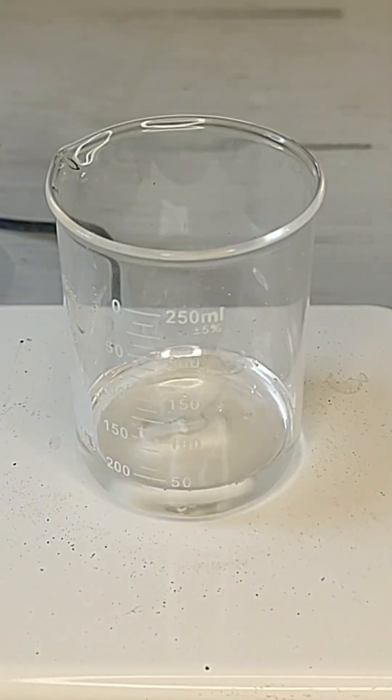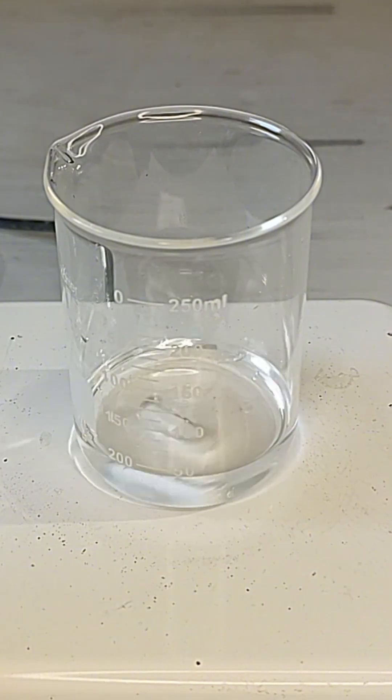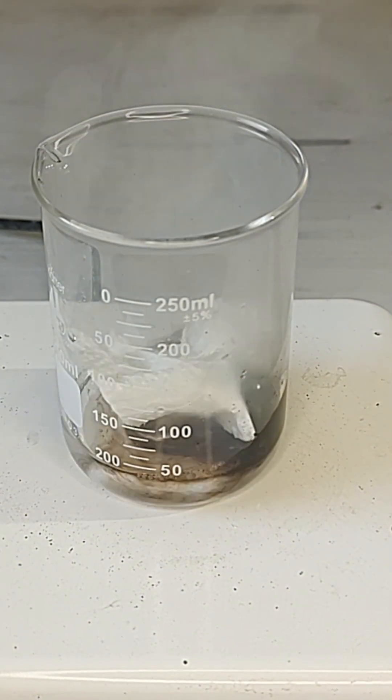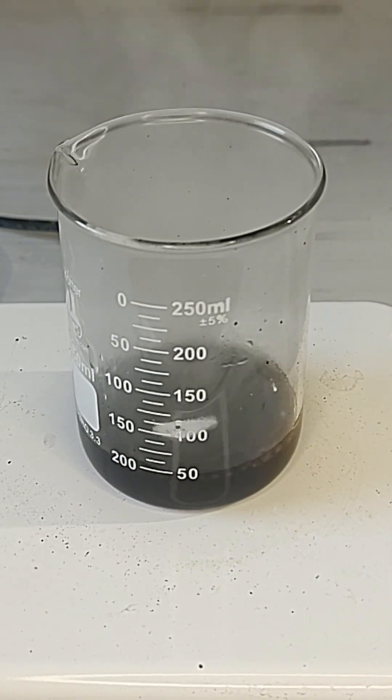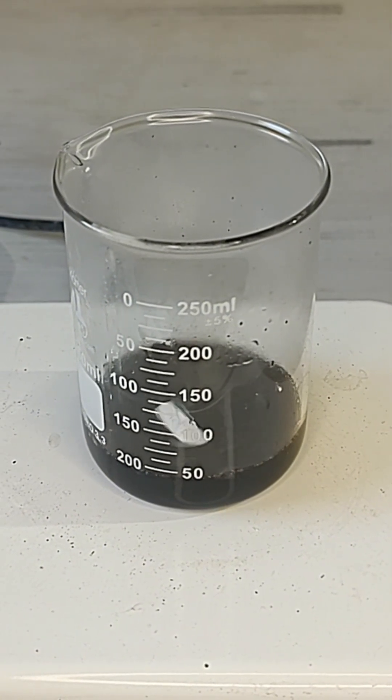This mixture is known as piranha solution and can turn pretty much anything organic into CO2. After letting them mix, it was finally time to destroy the evil napkin. I dropped it in and it instantly dissolved, but make sure not to inhale the gas because it's not fun at all.